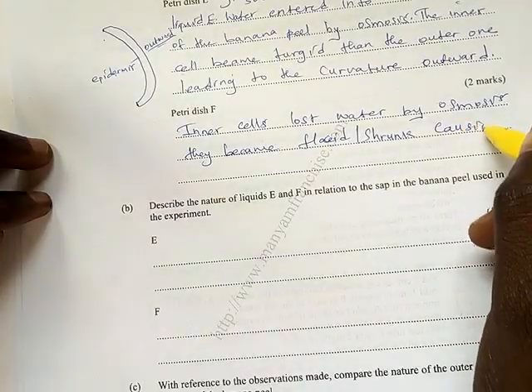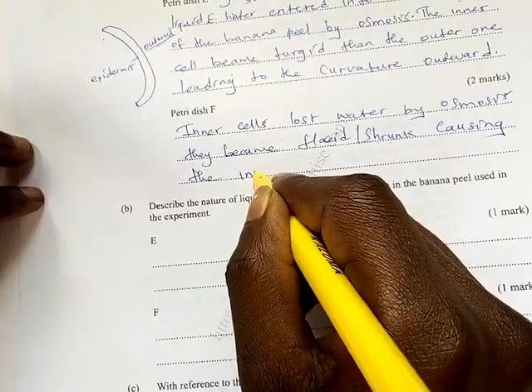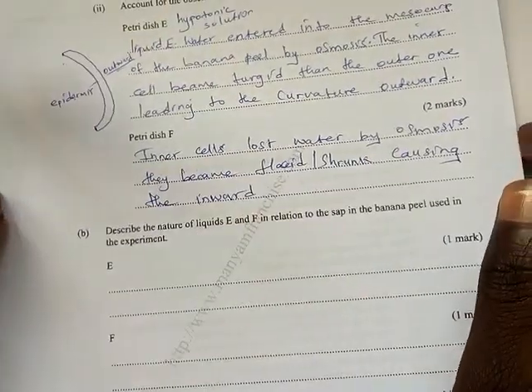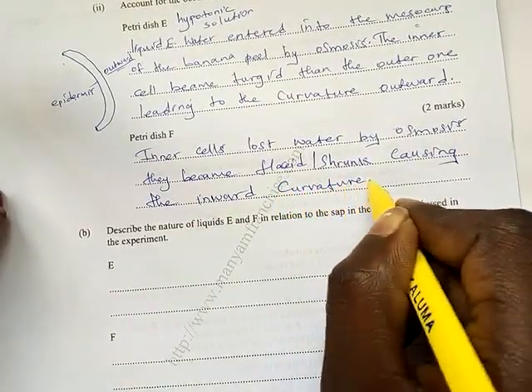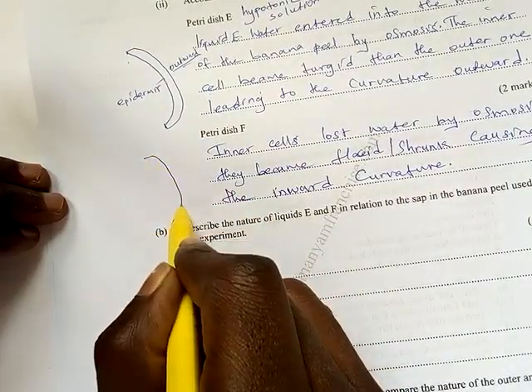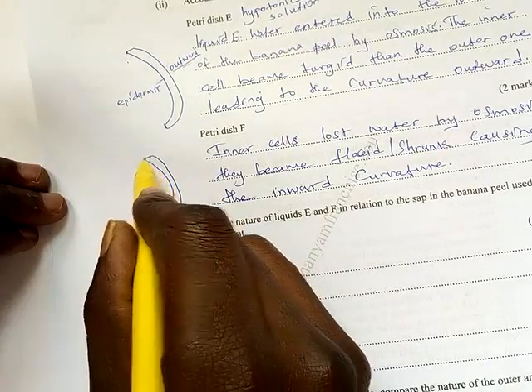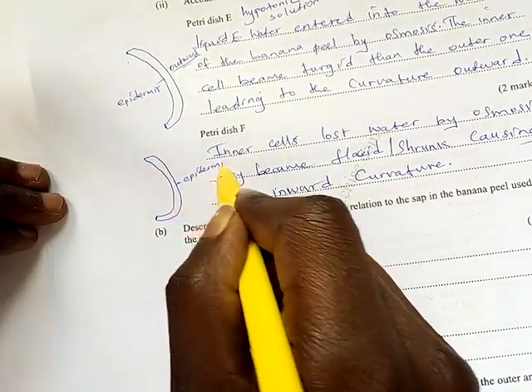causing the inward curvature. Now it looked like this. Now this is the epidermis. The curvature is now inside.